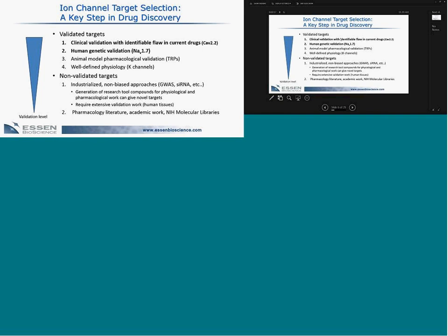So for ion channels, the highest information content comes from manual electrophysiology, but this is sort of approximate estimates of the throughput, and it's basically pretty low and it's not enough to support real drug discovery programs. Recently, the introduction of automated electrophysiology machines allows you to go with much higher throughput and only really modest reductions in the information content that the assays can spit out.